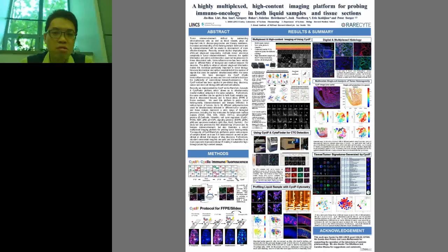Then we can probe, like in here, we do 4 rounds of staining, which already gives you 12 different markers. Now you can do a clustering analysis as well as a high dimensional representation in 2 dimensions. That's this plot you can see here, to identify the specific subpopulation. The most interesting idea here is that you can treat this as what we call an image cytometry method, but at the same time you can use the concept of antibody staining and try to do it in situ.